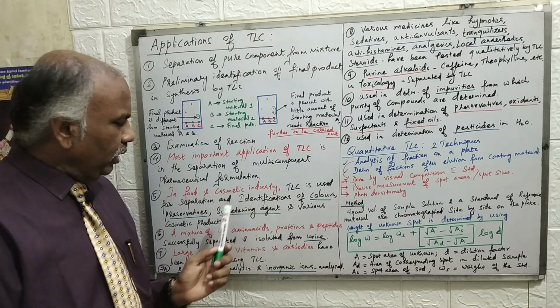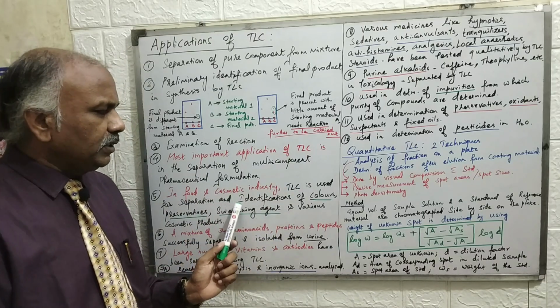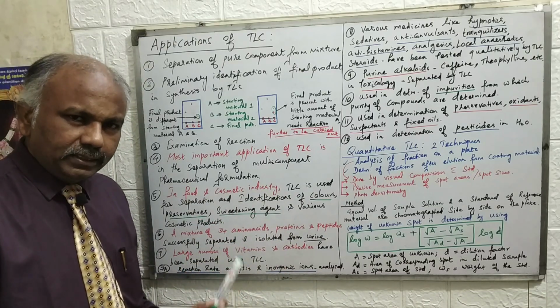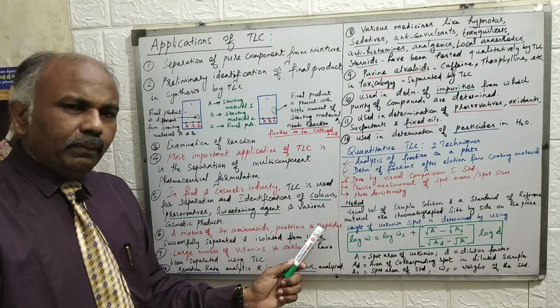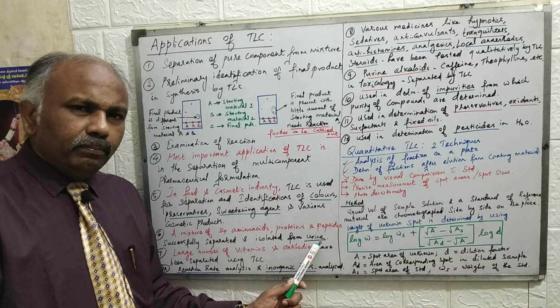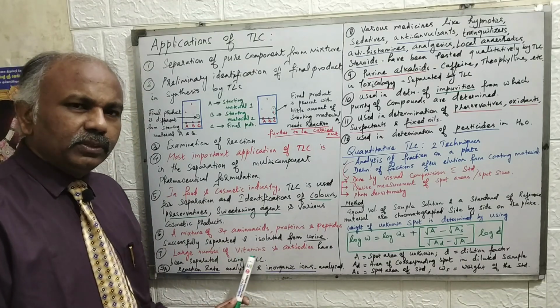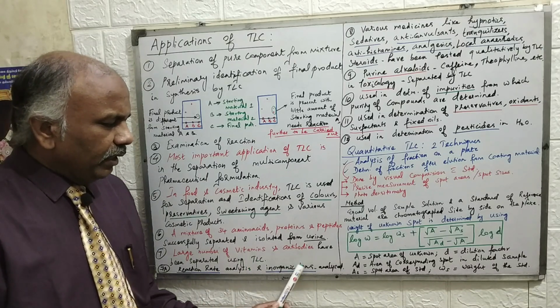Multi-component pharmaceutical formulation. In the food and cosmetic industry, TLC is used for separation and identification of colors, preservatives, sweetening agents and various cosmetic products. A mixture of 34 amino acids, proteins and peptides are successfully separated and isolated from blood samples as well as from urine samples. A large number of vitamins and antibodies have been separated using TLC, and reaction rate analysis and inorganic ions can also be analyzed by TLC.